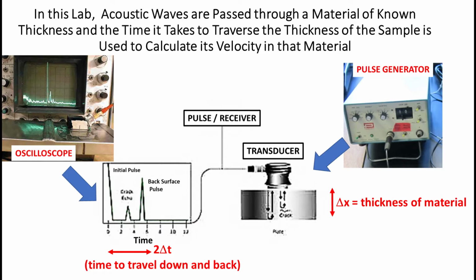In this lab, we will pass acoustic waves through a material of known thickness, and we will measure the time it takes for the acoustic wave to travel through the sample, reach the other side, and then reflect back to the transducer.